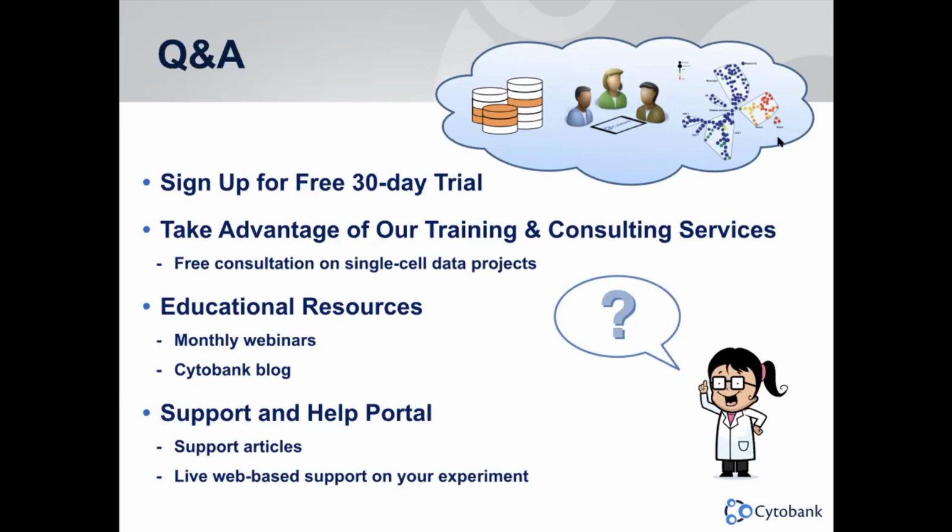Let's see, I do have another question here from an attendee. How to decide the number of clusters when running Citrus? Is there any approach that could be indicative, or do we need to test different values and check which one shows better results?